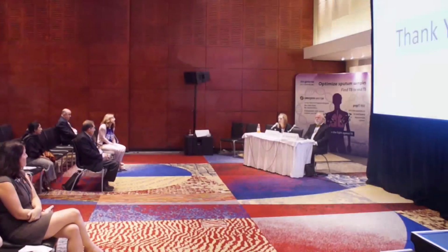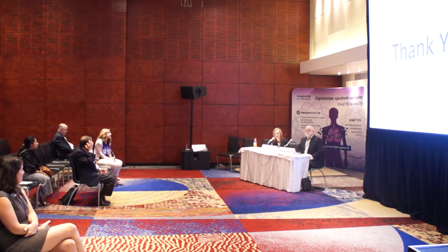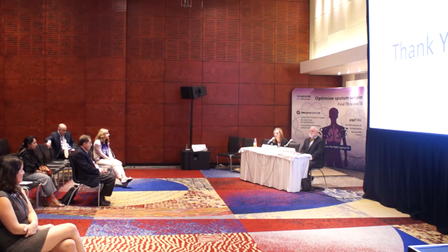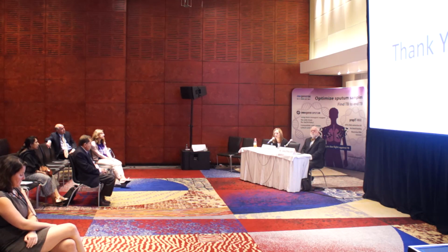What you can summarize from this are some common threads, and I'd like to point out just 3 of them. The first one would be right at the point of specimen collection, good quality specimen collection, and that will involve the training of the healthcare worker, as well as a good medium for storing that specimen during transportation because of many challenges like long distances, turnaround times to get to the laboratory, and high temperatures. And I think the very big thing is that if you have state-of-the-art assays with state-of-the-art laboratories, and you don't improve behavioral changes on the ground within the facility, none of the assays will be that sensitive. So I think that's a challenge for all countries.